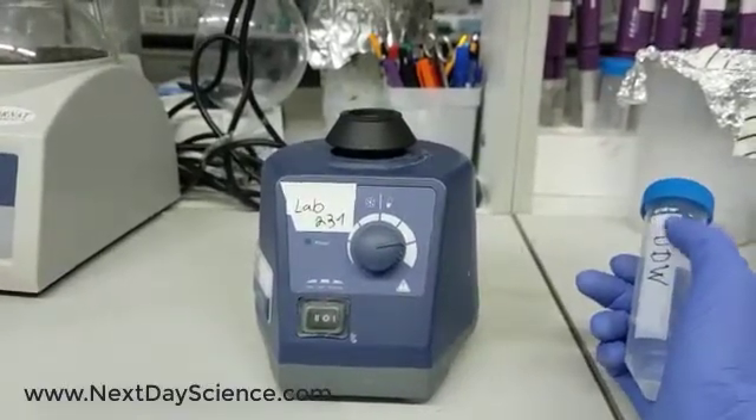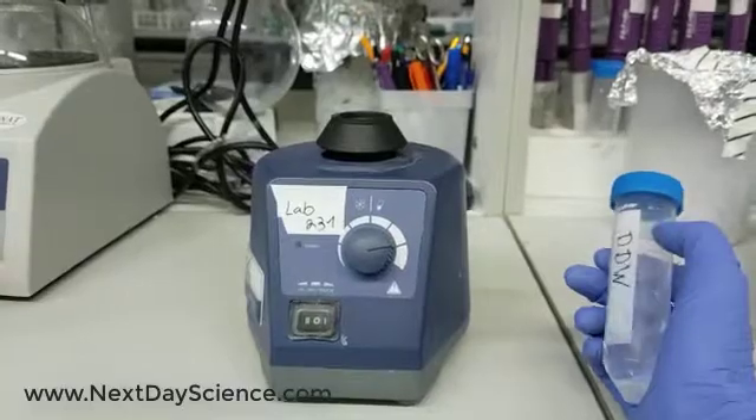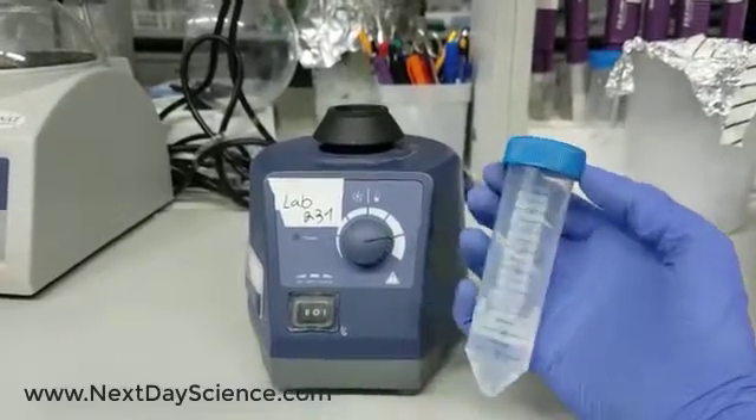It provides smooth, instant vortexing of even the largest sample sizes, including full 50ml tubes like this one, and we all use it.